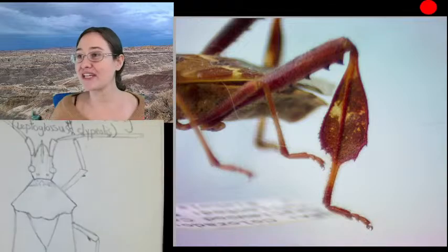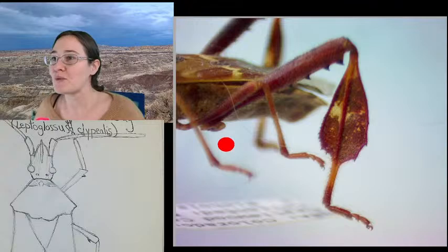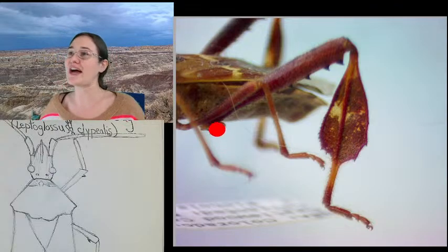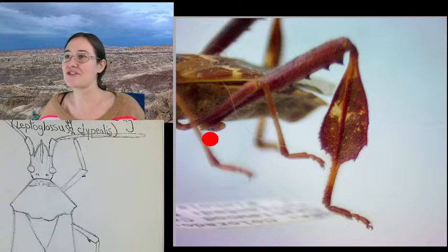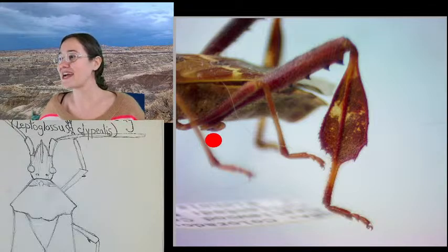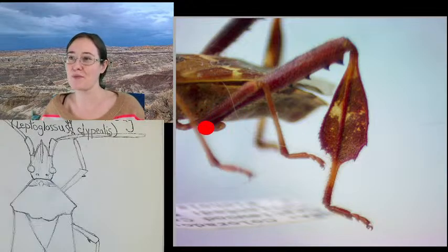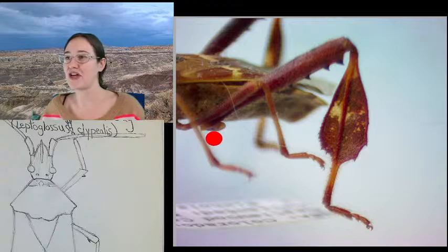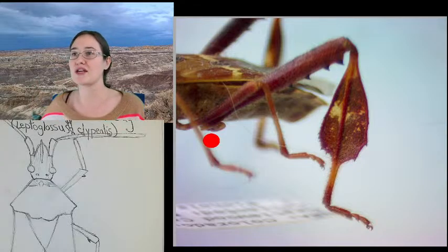So we are looking at this leg, and this is going to be our femur. We can see a little bit, you see this little ball coming off the bottom of this leg. That's actually the coxa, or kind of where the femur hits the hip, and that's what helps connect it to the leg. So that's a joint down there that's going to help my insect move its leg back and forth, kind of like our hip joints.